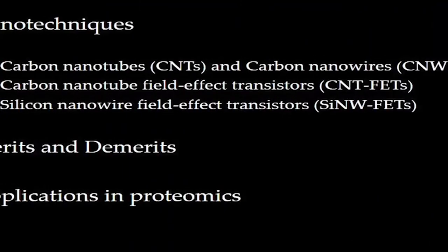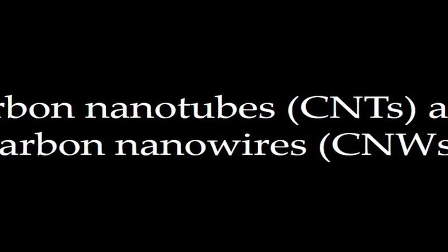In today's lecture, we'll talk about different nanotechniques used for proteomic applications. We'll talk about carbon nanotubes, nanowires, carbon nanotube field effect transistors, CNT-FETs, quantum dots, QDs, gold nanoparticles and nanocages, and microfluidics. Let us first talk about carbon nanotubes and nanowires.